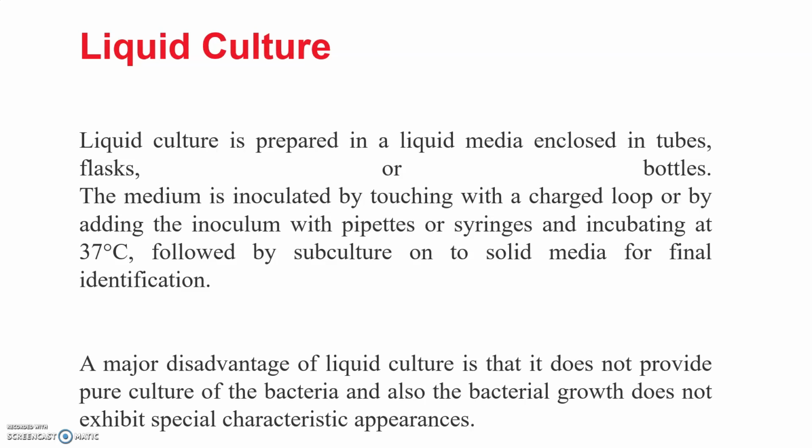After this incubation, we take that inoculum and subculture onto solid media for the final identification. That is the method of liquid culture.